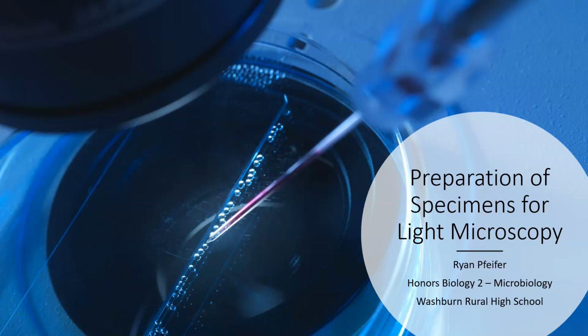Hey, Mr. P here. In this video, we're going to extend our understanding of microscopy from the standpoint of how we prepare specimens for observation with a microscope. We have to do a couple of things normally, because microbes are not naturally colored. They're translucent, or just don't readily give off the contrast needed to differentiate between some of their internal structuring. So we've got to use staining, we've got to use smearing, we've got to use fixing.